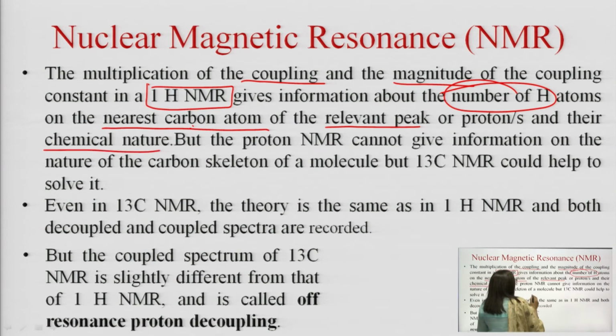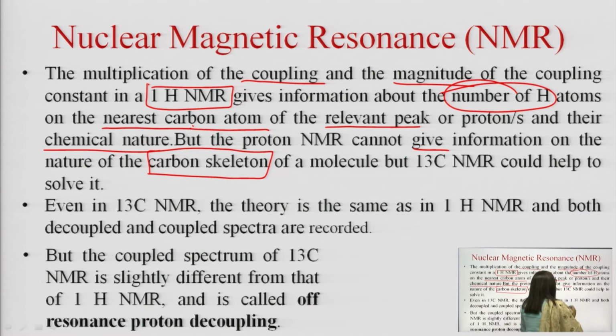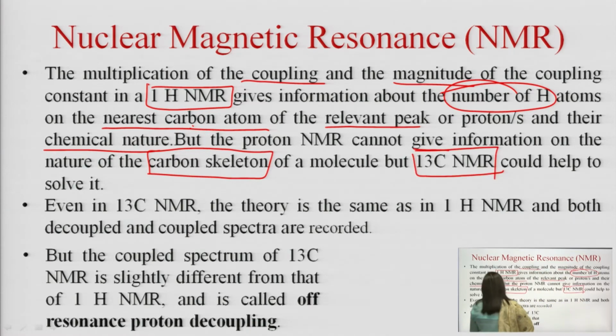But the proton NMR cannot give any information about the nature of the carbon skeleton of the molecule.